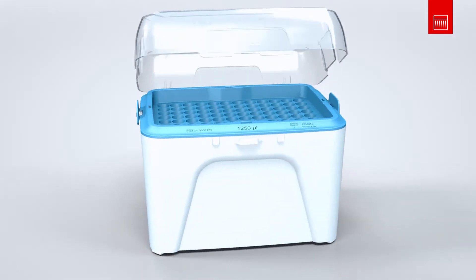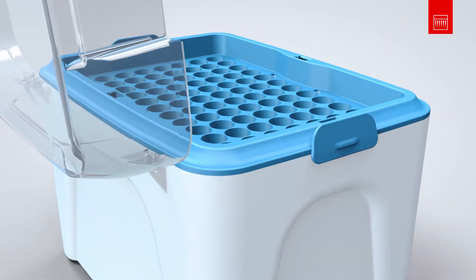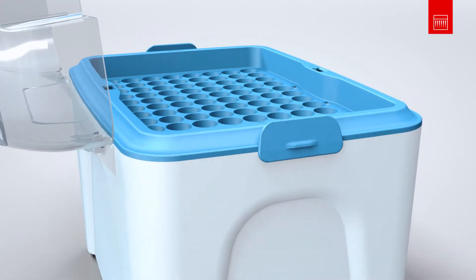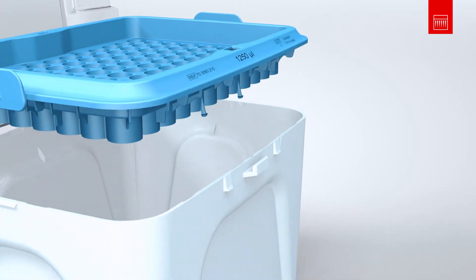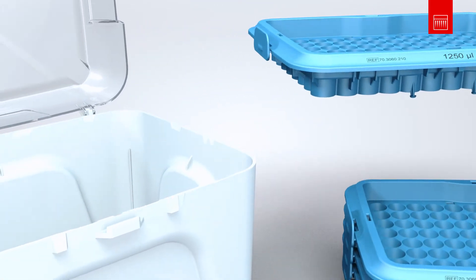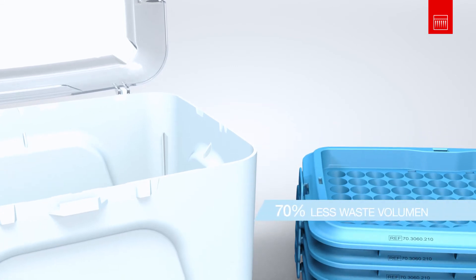The empty tray can easily be released from the box by pressing on the two side clips at the same time. You don't need to hold the box for this. Your box is now ready to be refilled quickly and easily with the Sarstedt single refill from the stack pack. This reduces the waste volume by up to 70%.